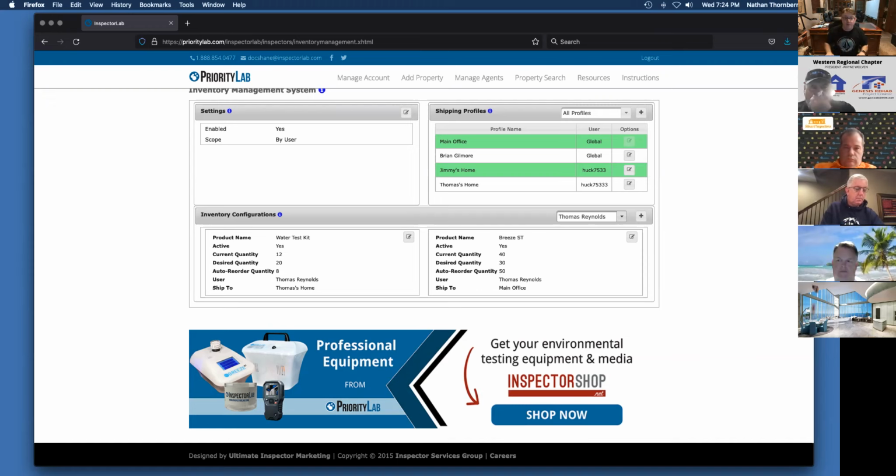And even if you forget to do that or don't do that as a matter of practice, we take it out of the poly bag or the shipping container at Priority Lab in Fort Lauderdale, and we scan it for you. And we associate all of the samples that were in a particular box, which doesn't matter that much on a normal day. But there's another thing that you should set up here, and that is your shipping labels. So it can automatically add shipping labels when they get depleted. Well, we have to track shipping labels. You might use one shipping label for 5 different tests. So we track all of that, and we do it through our digital systems. Great question. Keep them coming.